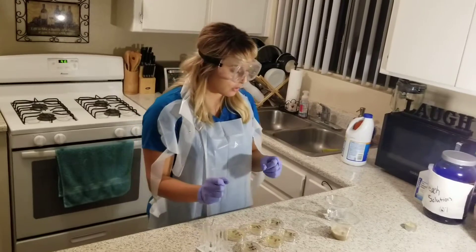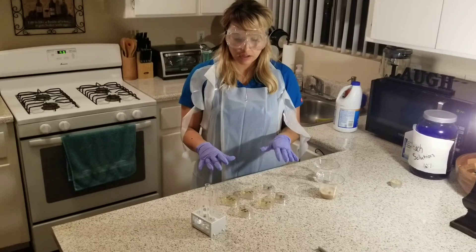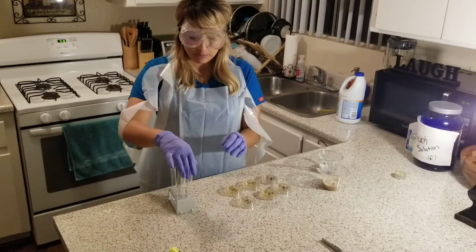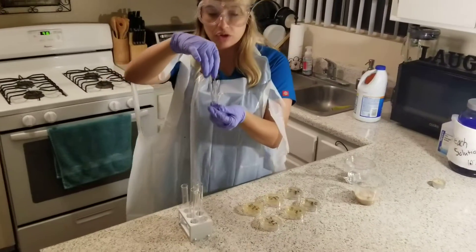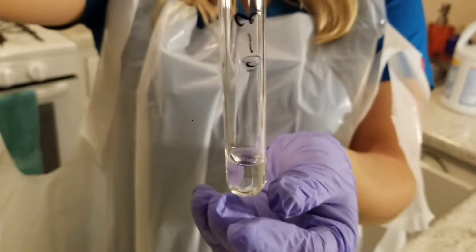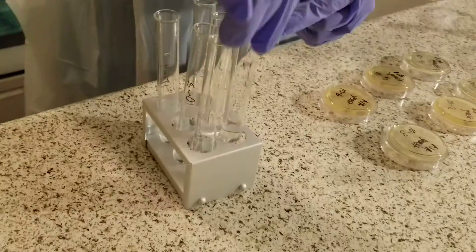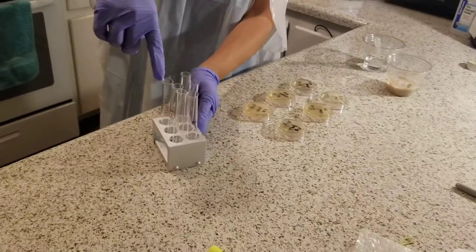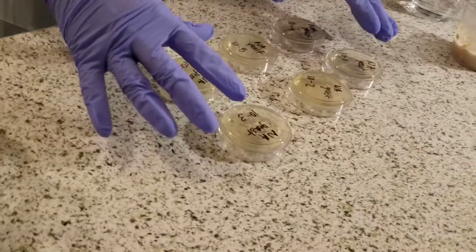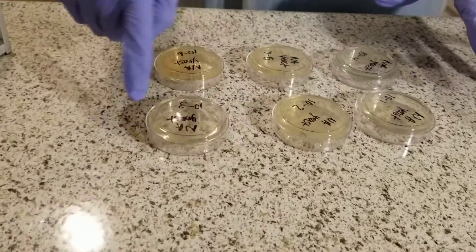In this lab, the first thing I'm going to do is clean my surface with a 10% bleach solution to make sure I have a sterile environment. Secondly, I have all of my labeled tubes. In these tubes is distilled water, and each of them is 2.25 ml of distilled water. I have them labeled 1 through 6. I also poured my agar plates yesterday and made sure they were ready for the experiment today. They are also labeled 1 through 6.